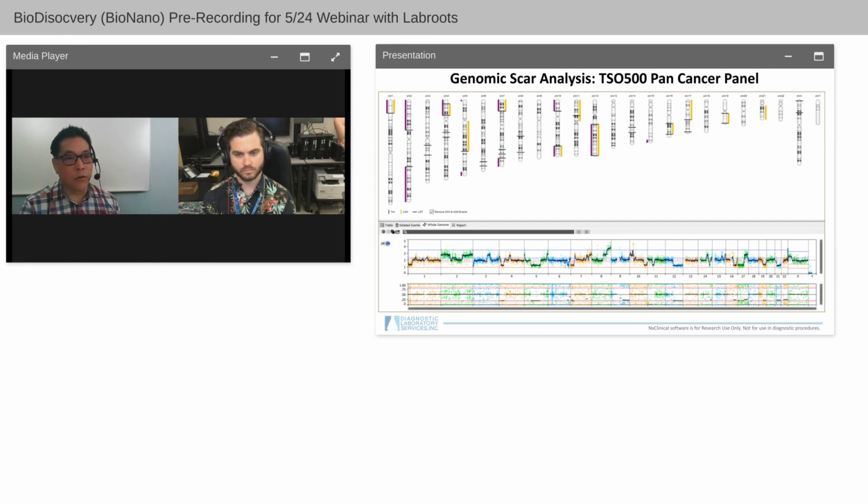We also look forward to maybe seeing if we can do this by optical genome mapping, which I'm sure, because BioNano and Biodiscovery both have that type of collaboration, is going to be very interesting to see how that data looks.